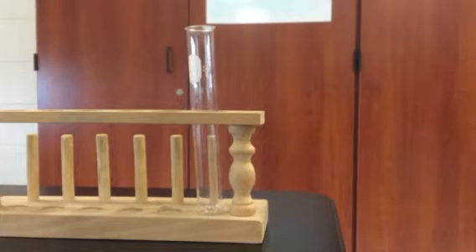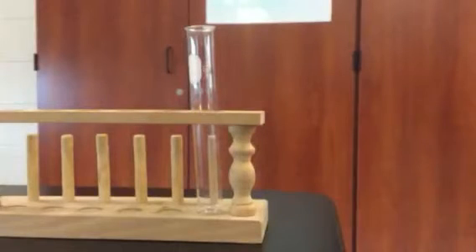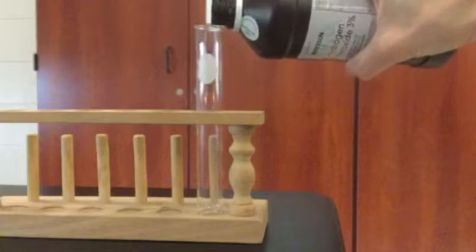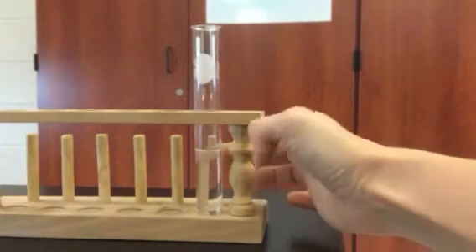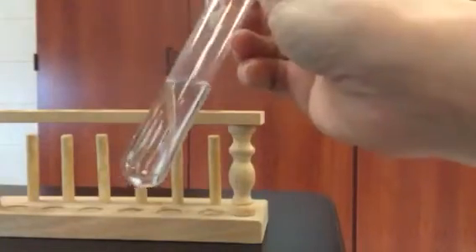Hi guys, so this is reaction one for our lab. I'm going to take some hydrogen peroxide and pour it into my test tube. Bring it a little closer so you can see. There's our hydrogen peroxide.